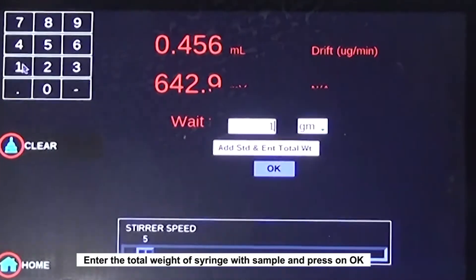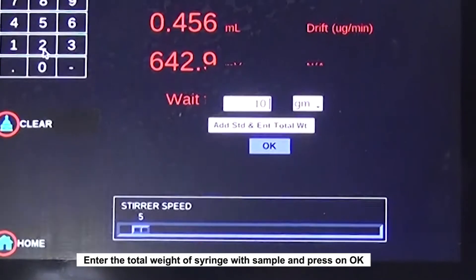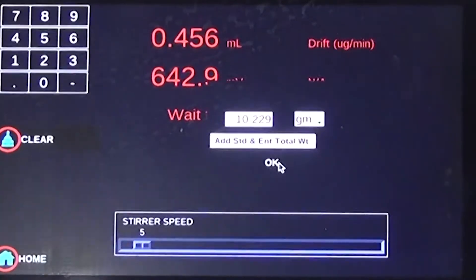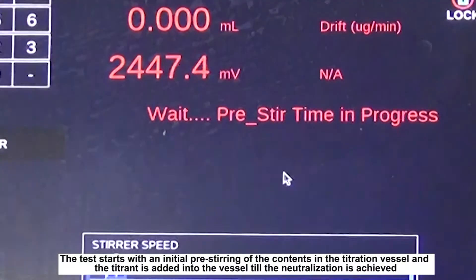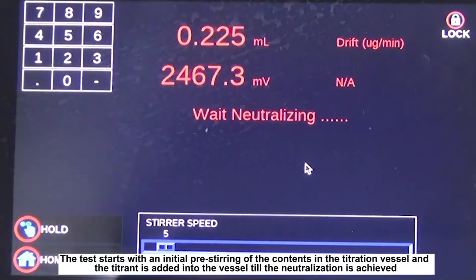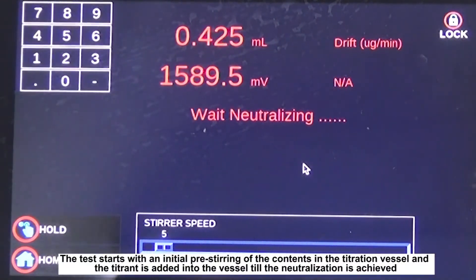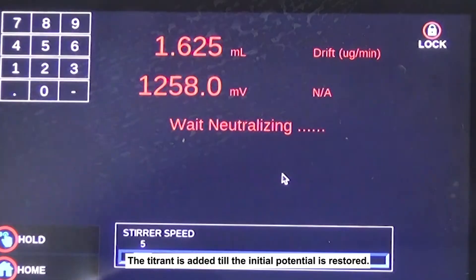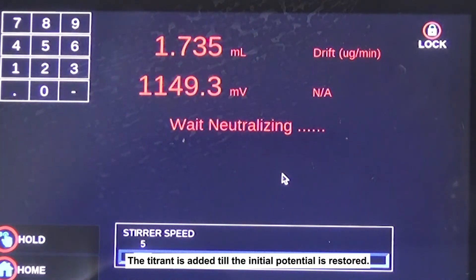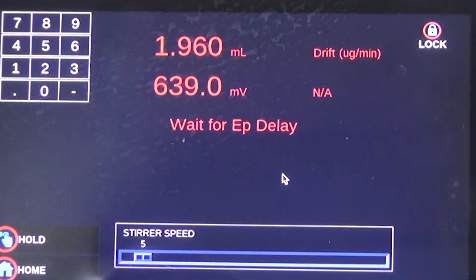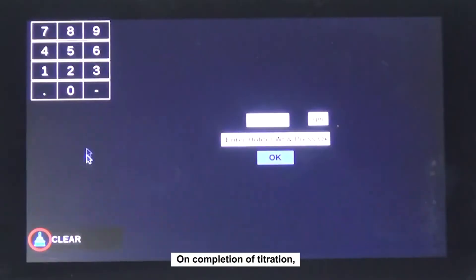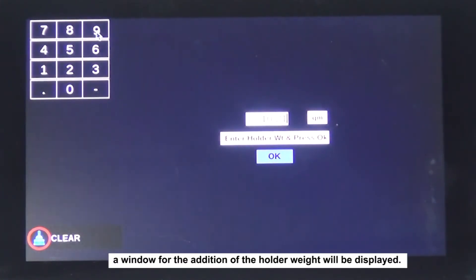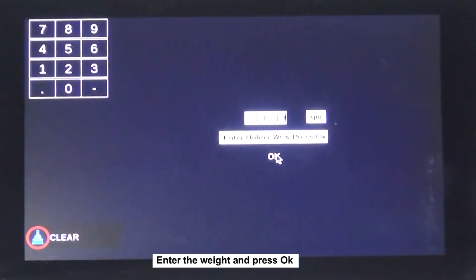Enter the total weight of the syringe with sample and press OK. The test starts with an initial pre-stirring of the contents in the titration vessel, and the titrant is added into the vessel until neutralization is achieved and the initial potential is restored. On completion of titration, a window for the addition of the holder weight is displayed; enter the weight and press OK.